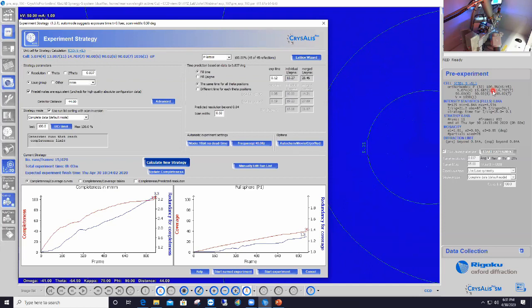So here I've got 100%. It doesn't have to be exactly 100%, but I like to see at least 85 to 90% there. And make sure also that the number of reflections from which that percentage number is calculated is high enough. So at least 15 to maybe even 20 reflections at this point is desirable, because if you have too few reflections, well, then those numbers, the unit cell parameters, are not really reliable. So enough strong reflections, 15 to 20 would be nice, and a high percentage number of reflections indexed.